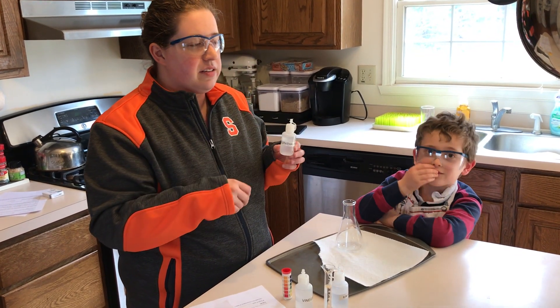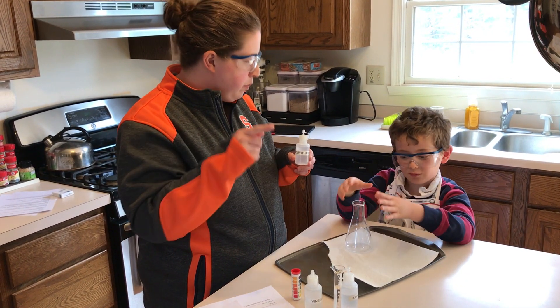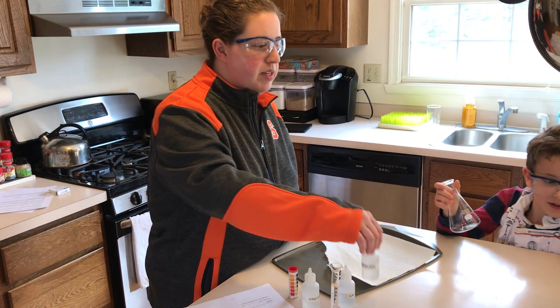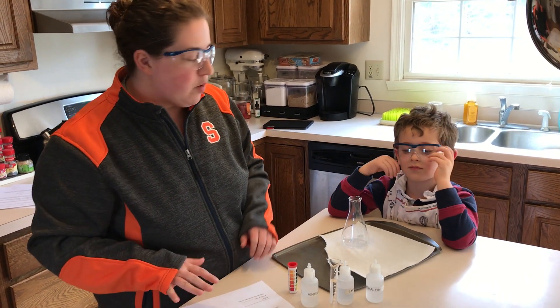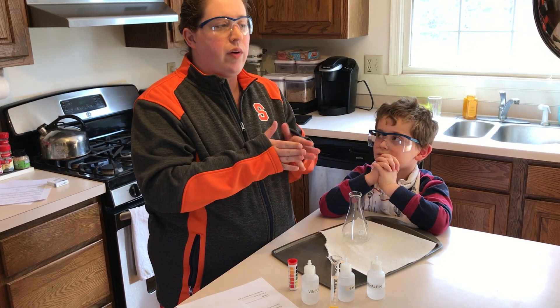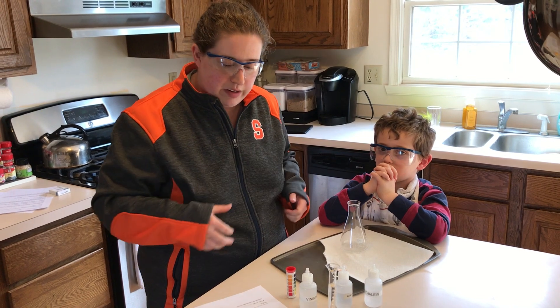This is called phenolphthalein and it's an indicator. It's going to go from colorless — no color — to pink. And when it turns pink, we're going to be done. So when you see the color change, that's when we're going to have our endpoint being met, when acid equals base, when we've been neutralized.